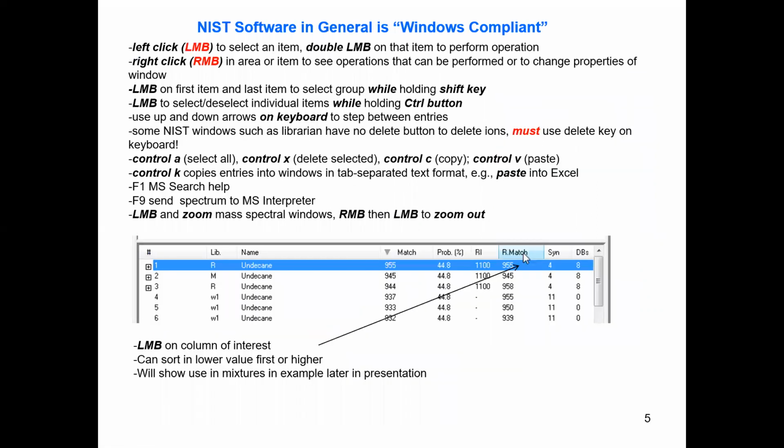The Windows software, this software is pretty much Windows compliant, just like most Windows applications. So all the common keys that you might use, might be a couple extra like F9, send a spectrum to MS interpreter, but in general, very Windows compliant.